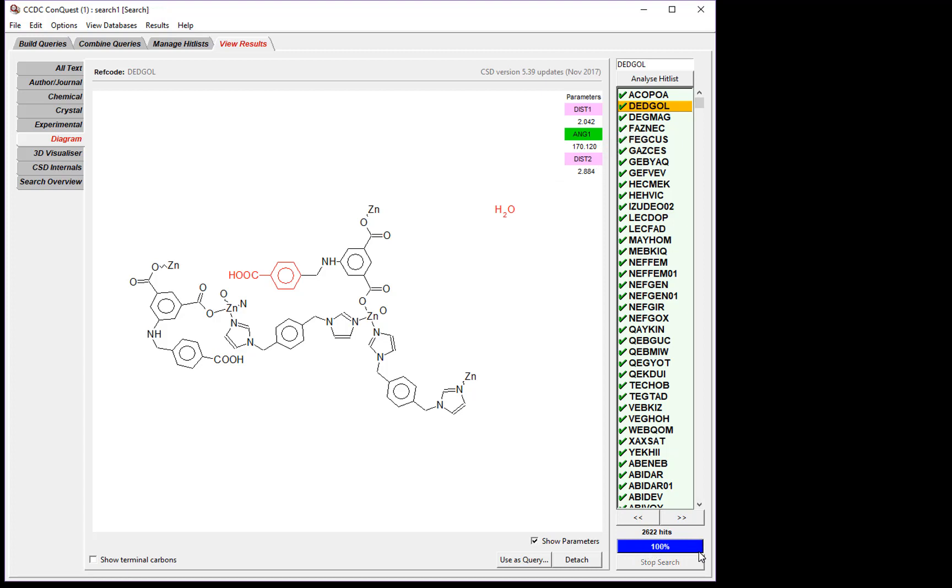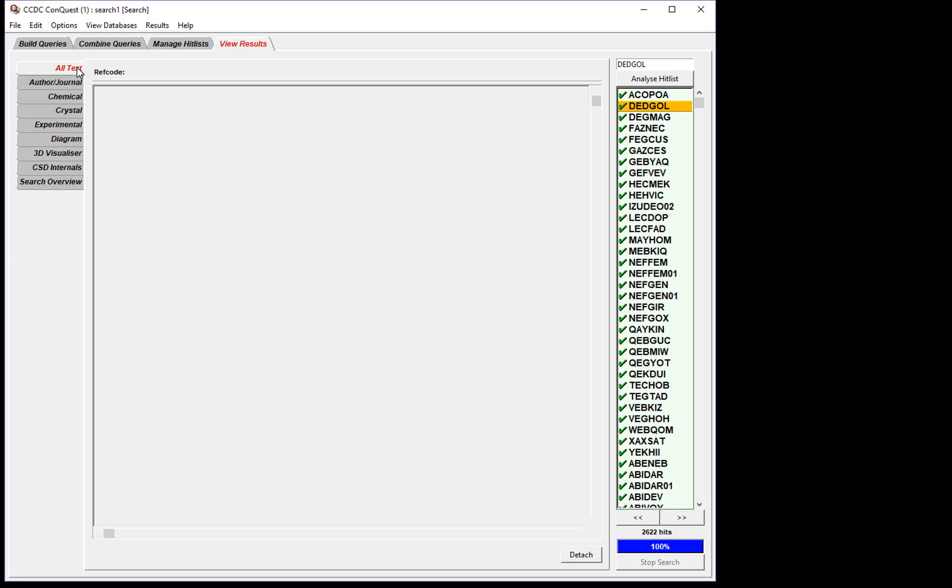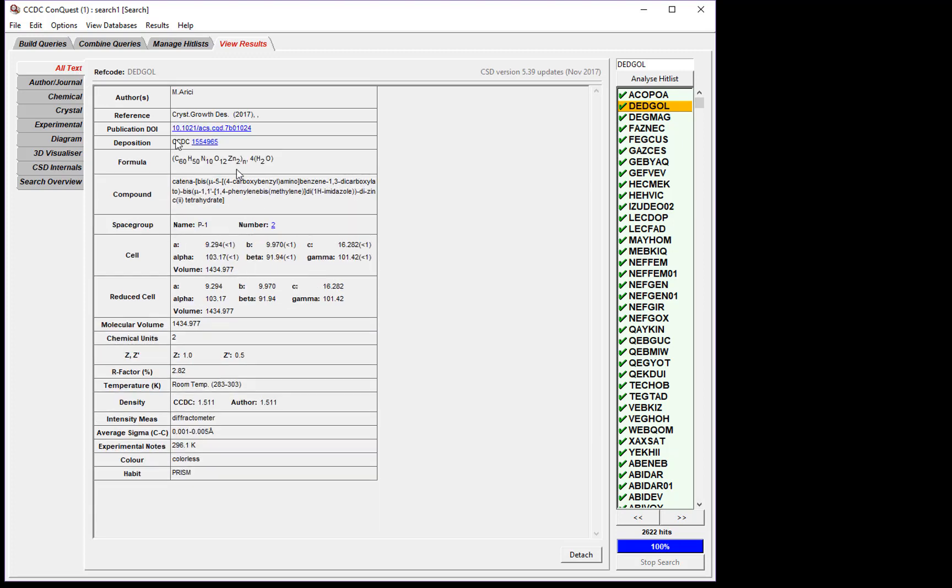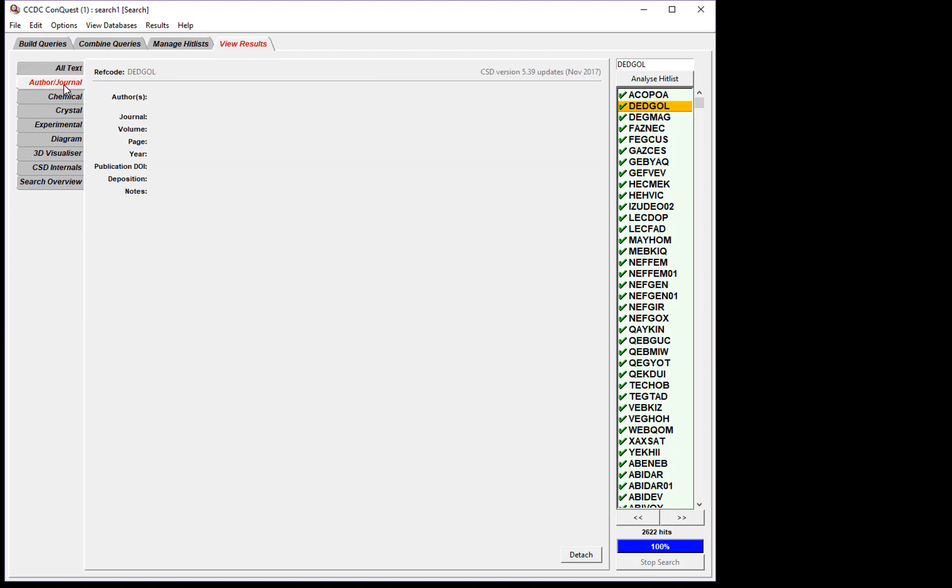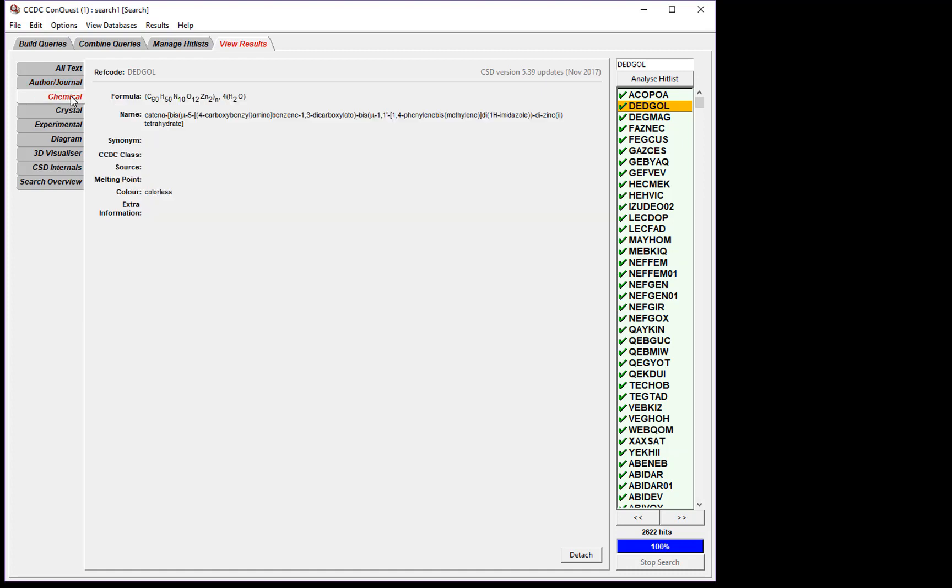You'll see once the progress bar gets to 100%, the search has stopped. On the right-hand side of the window, we can see information about the structure. All text shows us everything that is available about the structure. We can look at publication information, including the document DOI, so we could click this link to be taken to the journal article. We can see chemical information, crystallographic information, experimental information, and a 3D visualizer.